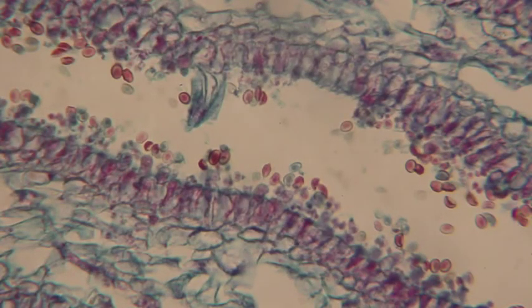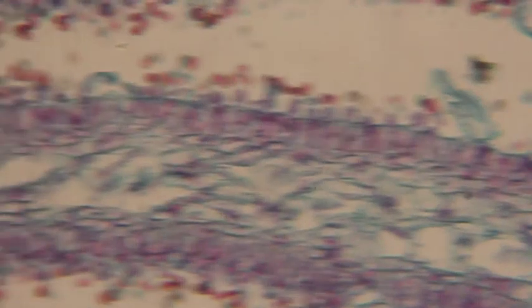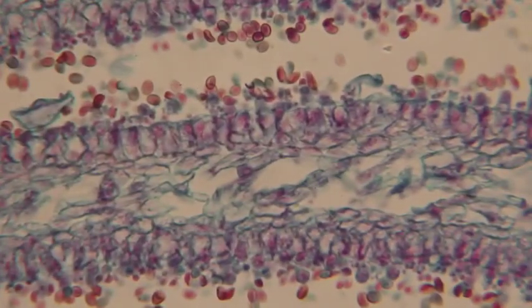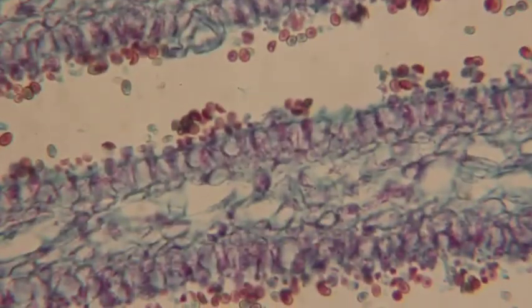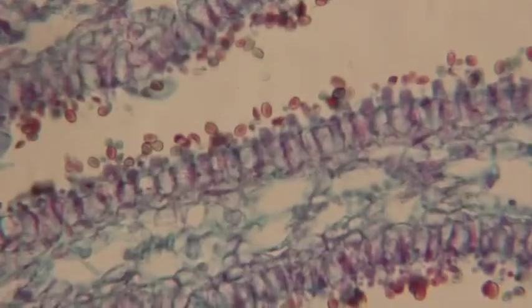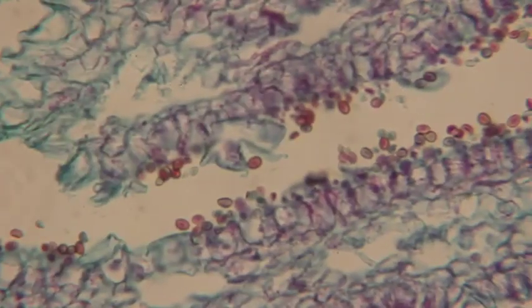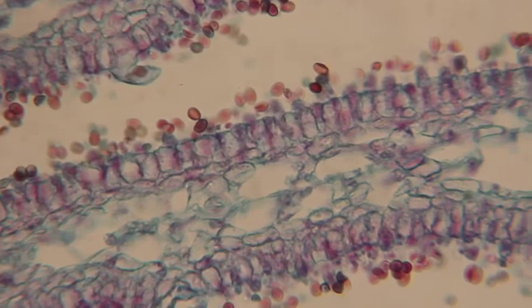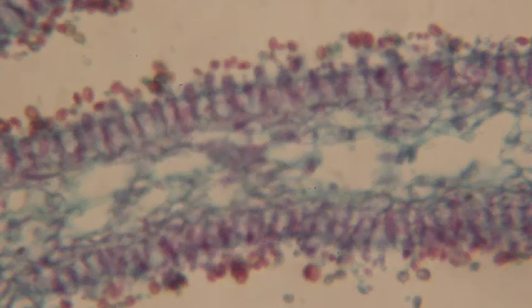It would be nice to find a good one with four spores. I'm going to search a little bit here to see if I can find a better one. Some of these are pretty good. It's hard to actually see all four spores on these just because usually you can find two in the front and two in the back. We'll go down to that one — that one looks about the best.